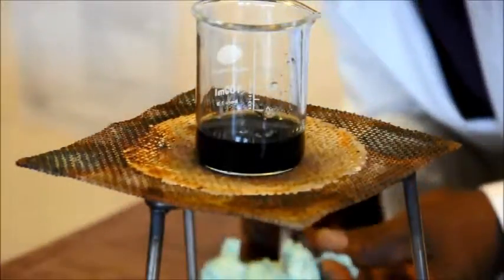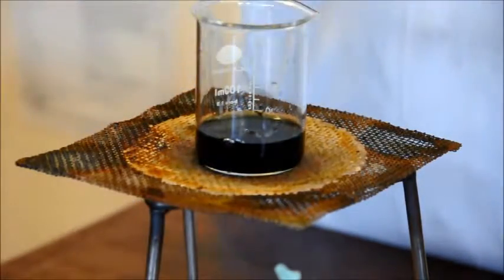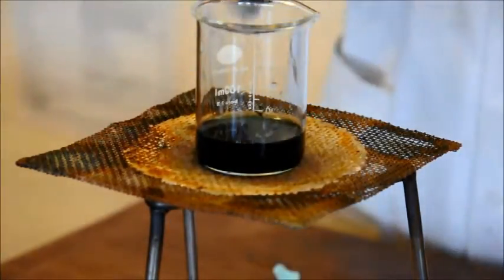I believe that is it. So in this beaker, we've got copper sulfate solution and unreacted copper oxide. I need to remove the unreacted copper oxide. That's the next stage.